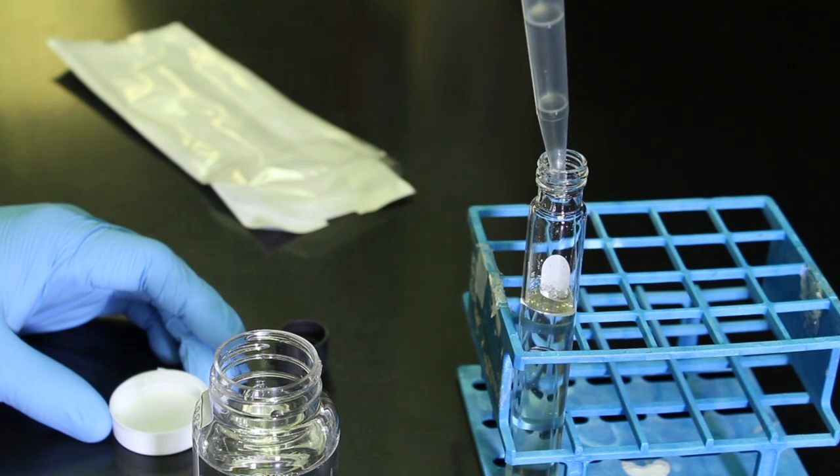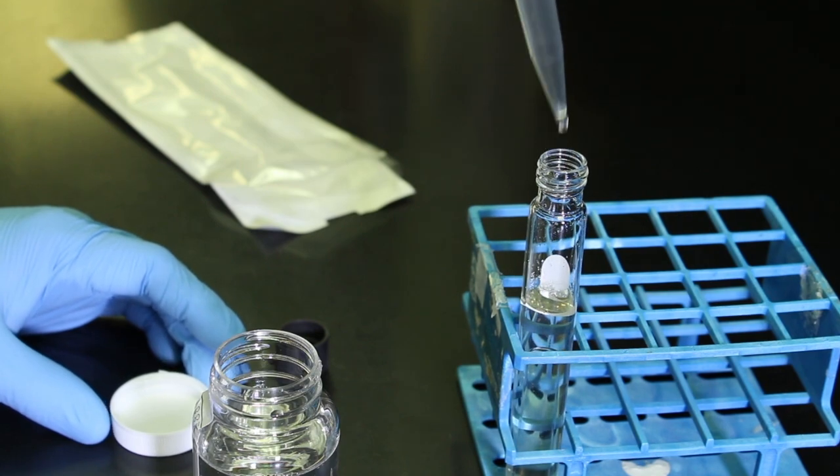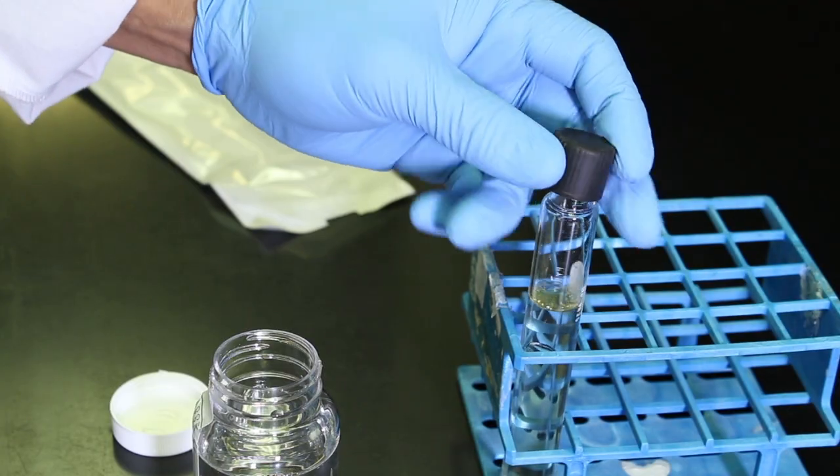If coliforms are present in the sample, they will use this sugar as a food supply and will produce carbon dioxide gas as a waste product. Any gas produced will be trapped within the smaller, inverted tube inside the main test tube.